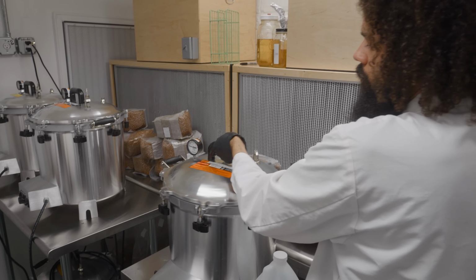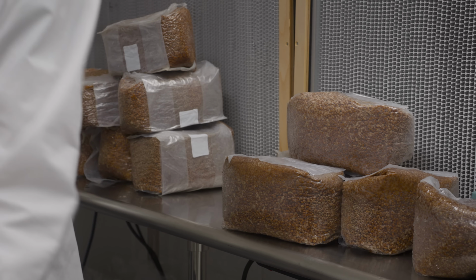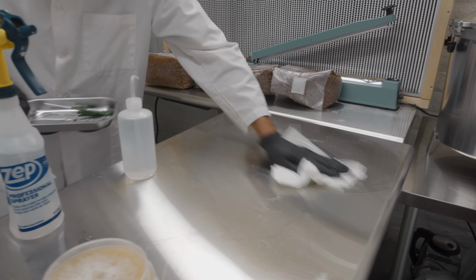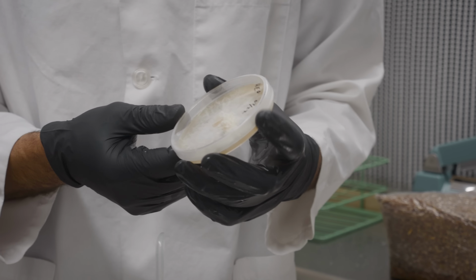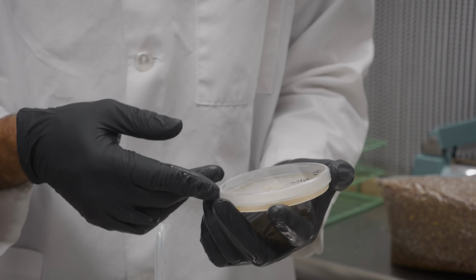Close that up and make some room, and kind of set myself up for a nice inoculation. These petri dishes have been examined for optimum growth, so we can see that the mycelium is healthy. It's colonized across the petri dish.